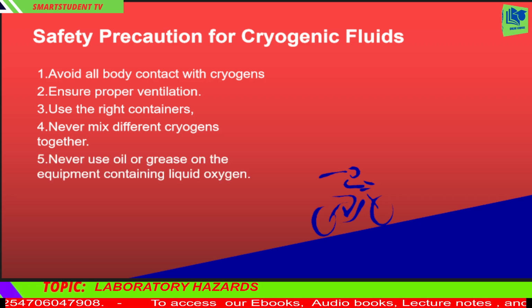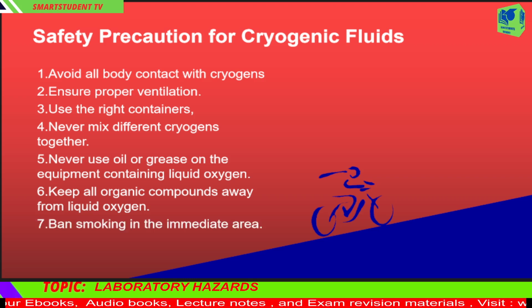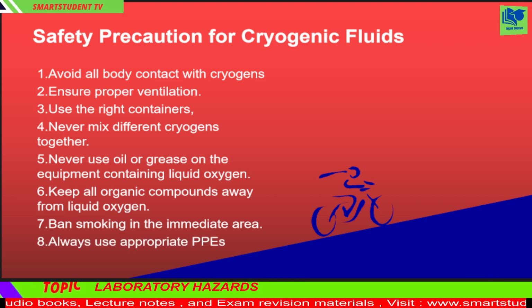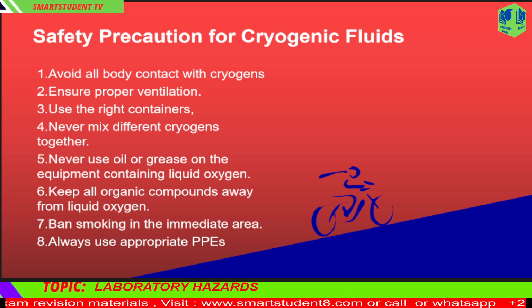5. Never use oil or grease on the equipment containing liquid oxygen. 6. Keep all organic compounds away from liquid oxygen. 7. Ban smoking in the immediate area. 8. Always use goggles, face shield and cold-resistant gloves when handling cryogenic liquids. 9. Make sure that any container used to hold cryogenic liquids is suitable for use with extreme cold.